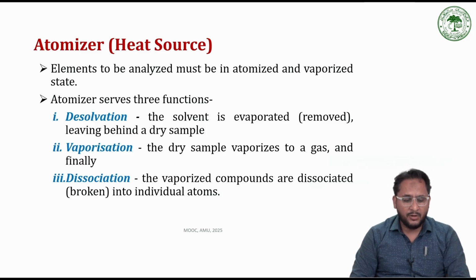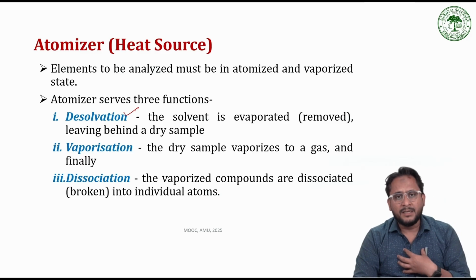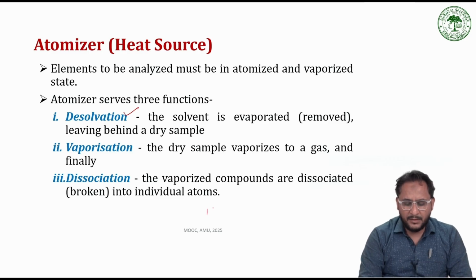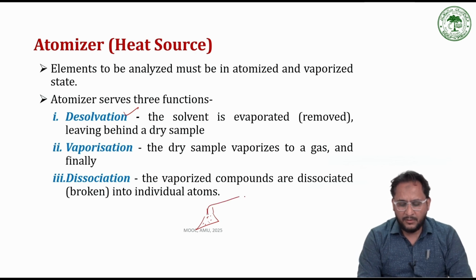The first function of this atomizer is desolvation, because, as I said, the sample is in liquid form earlier, meaning our analyte is dissolved in some solvent. Then that liquid is taken by the nebulizer, where it is mixed with fuel as well as oxidant to form an aerosol.